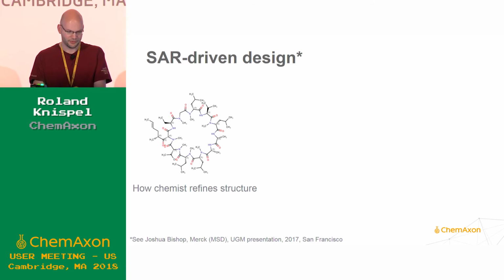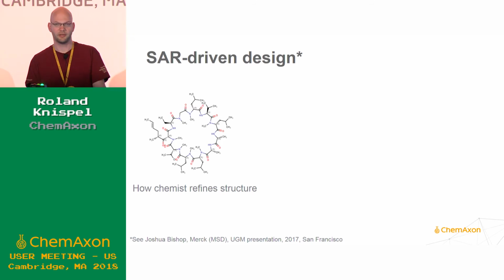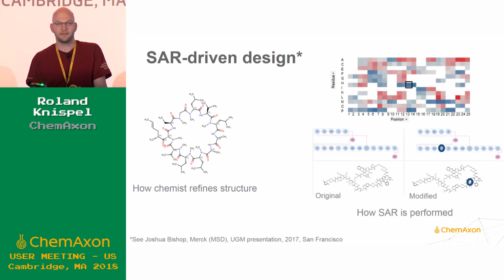They said one of the biggest challenges they have is they have people that do design of molecules, chemists, that are looking at a structure that represents a peptide by looking at the chemical representation. They start drawing these things out. And then they're synthesizing this based on a monomer library, where essentially all these little building blocks are housed in a catalog of about a couple of thousand. And then they have their robots that bring these things and put these things together, and the output is a peptide library, and they start measuring activity.